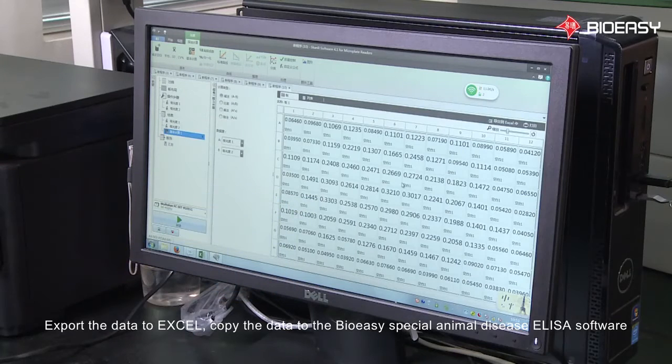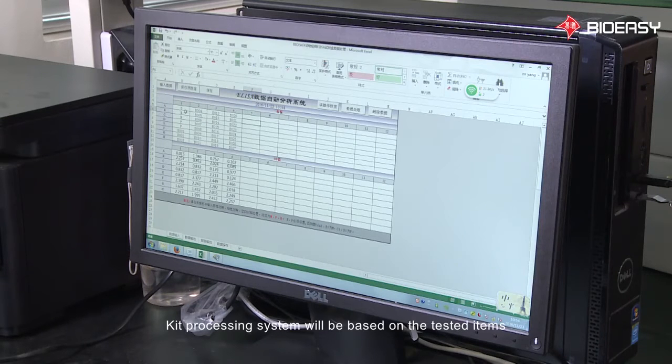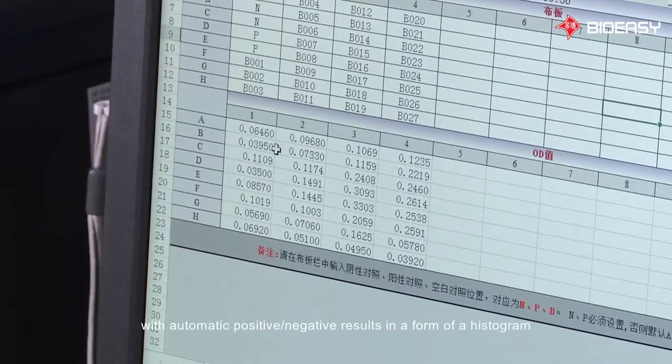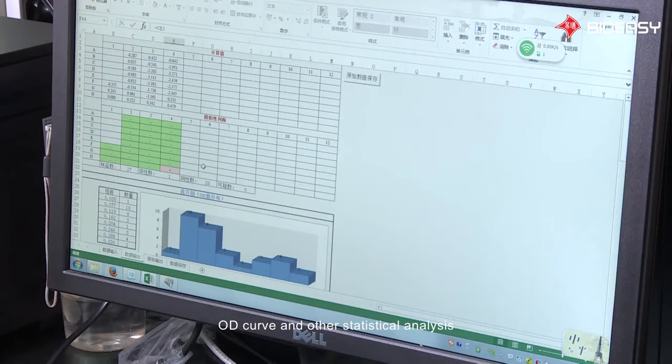Export the data to Excel and copy the data to the Bioeasy special animal disease ELISA software. The kit processing system will automatically generate positive and negative results in the form of a histogram, OD curve, and other statistical analyses.